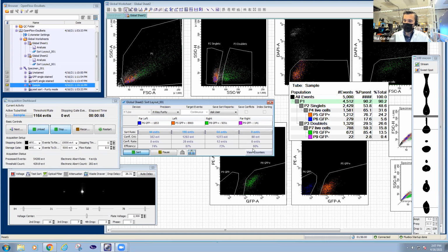And you can see now that the efficiency looks more like what we're used to, 72%, 81%, 74%. Now this one, 33, 40, 80, this one is going to oscillate much more, just because statistically we have very few events. So it's trying to calculate an average efficiency, but it's sorting too few events live, and so it won't give us a very accurate number as it's refreshing. So it becomes a bit harder to interpret. Like now it seems that I have 100, but then I have 0. So it depends on the amount of events that are being sorted.